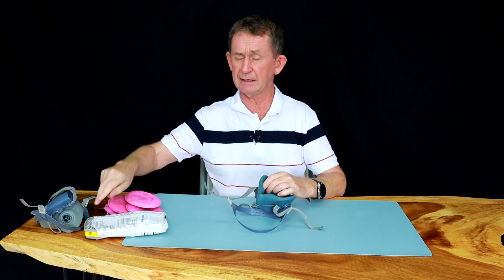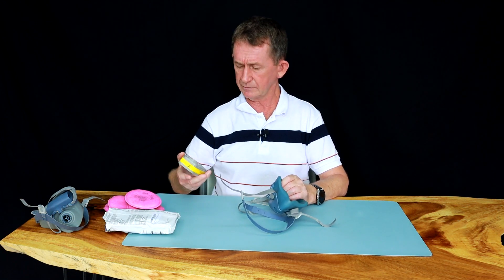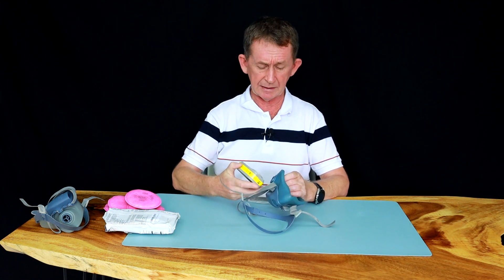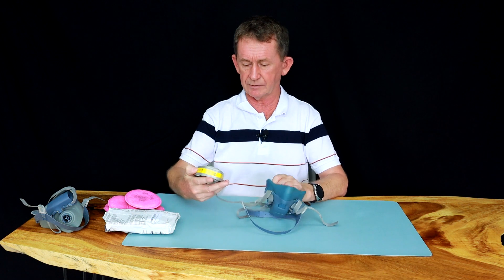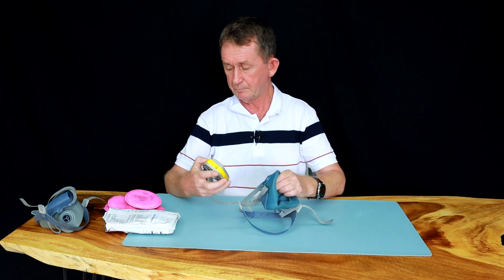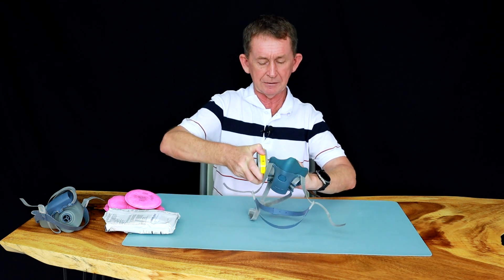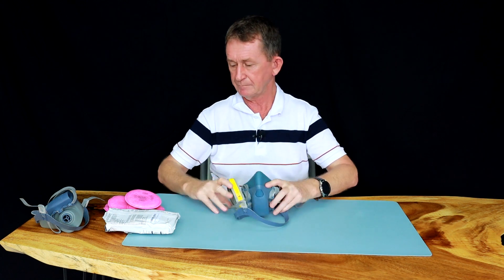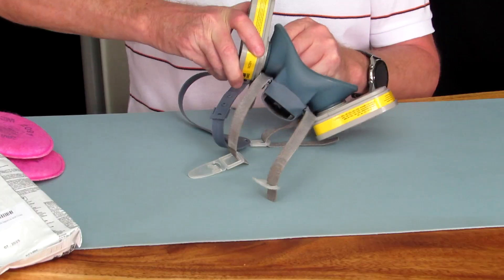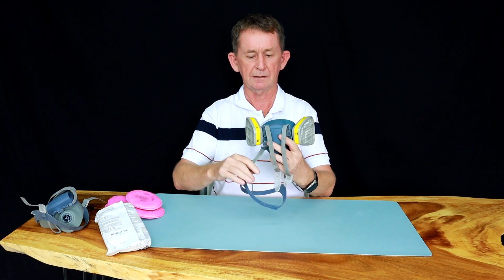The mask also takes the 6003 filters. These only go on one way because there are two big notches here and a small notch here, so you cannot put them on the wrong way. They go in like this, facing back this way. I'll put both of them on for you — and that's how you fit these.